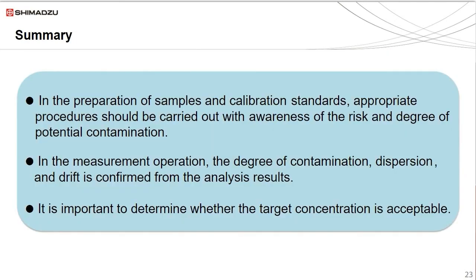So, to summarize, we recommend sample preparation, digestion, environmental, and sample introduction hardware systems to be optimized for low contamination potential. Contamination, drift, and variability can be quantified easily during analysis. Calculating the target concentrations can be done easily using the relevant regulation, USP or otherwise.